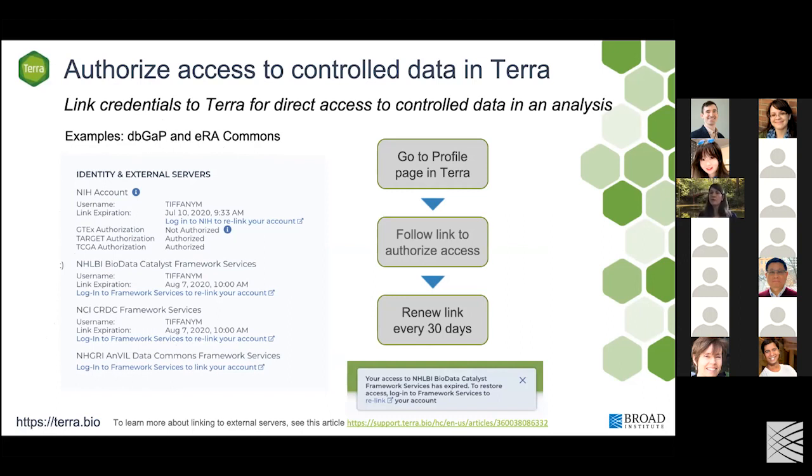And you also do have the option to unlink if you don't want to keep getting reminders to relink your account. It is very important that you do renew links in a timely manner, because if, for example, you're running a multi-day analysis and your link expires in the middle of that, you will lose your access to the data. So just be mindful of that if you're working with controlled access data.